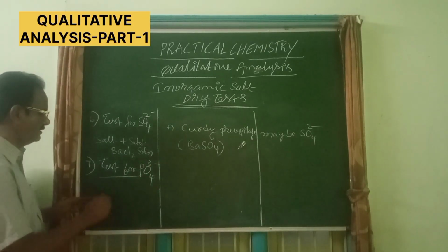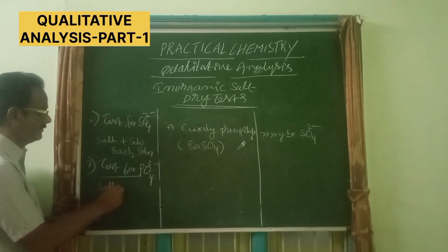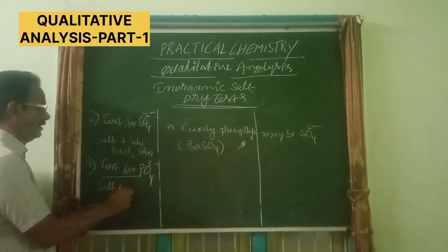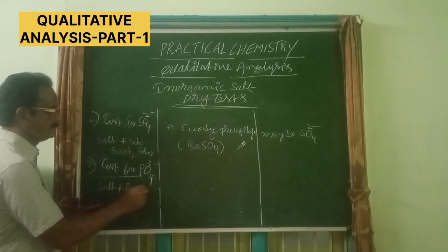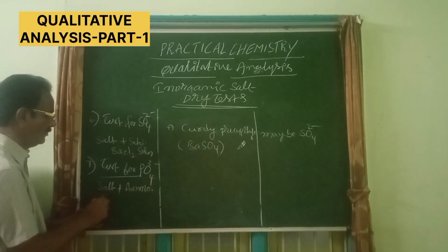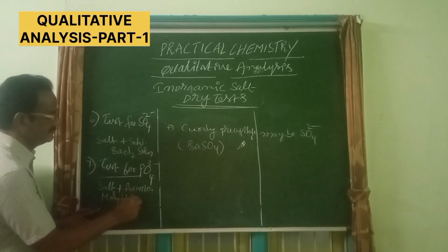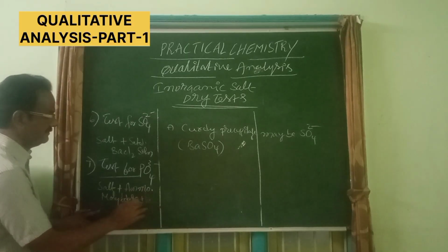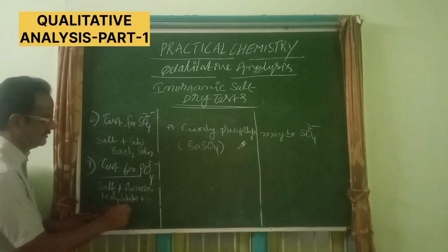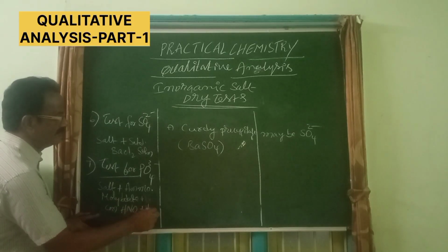Here the test is conducted like this: salt plus ammonium molybdate solution plus concentrated HNO3, and then subjected to heating.